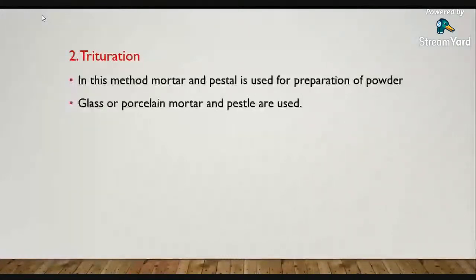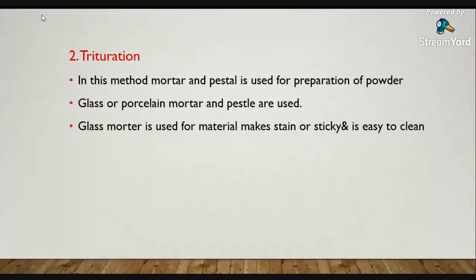Now generally a porcelain mortar is used, but in some cases glass mortars are used. Why are glass mortars used? They are used for materials which are sticky like gum, and materials which are staining or which give a stain to the mortar, like iodine.